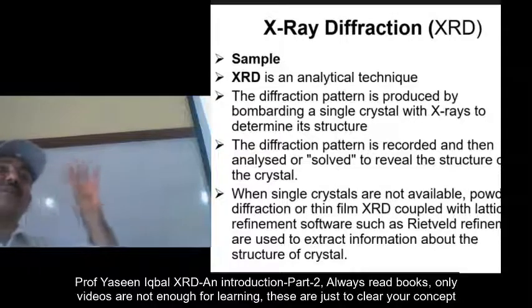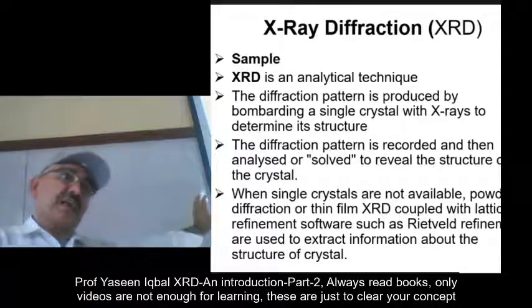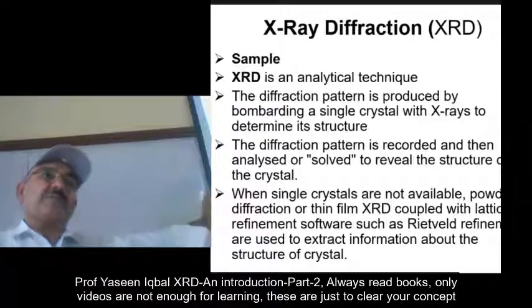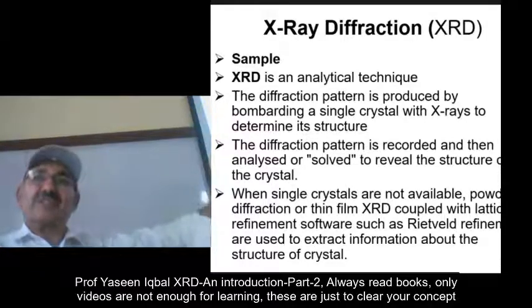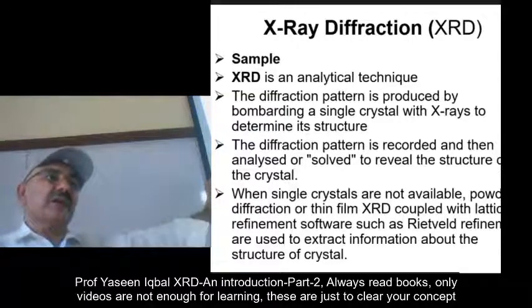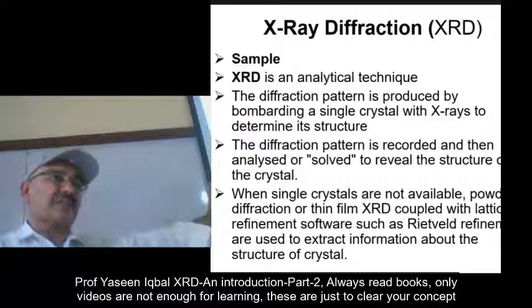So all this information is published in that data. And from MRL, we have 15 cards in that global data. Our previous student did some excellent work, and I published those cards in the ICDD data files, right?